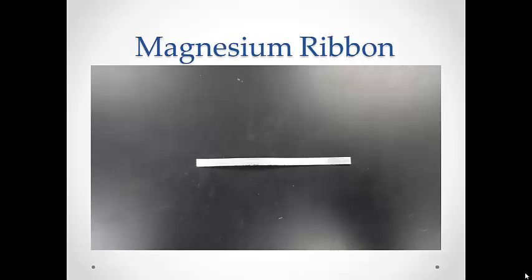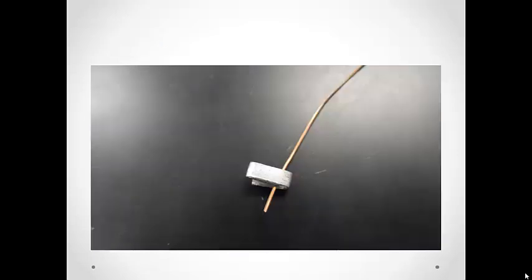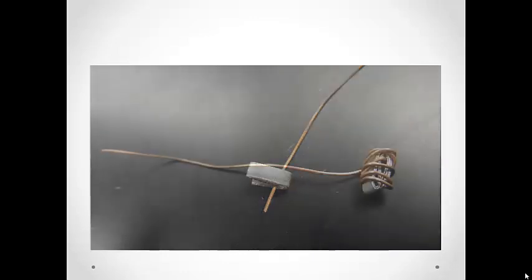Take a short length of magnesium ribbon and measure it to the nearest tenth of a millimeter. Fold that magnesium ribbon in half a few times. Then wrap the copper wire around the folded magnesium to form sort of a cage around the magnesium.